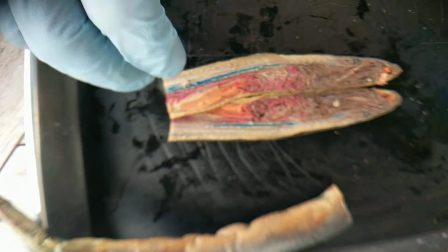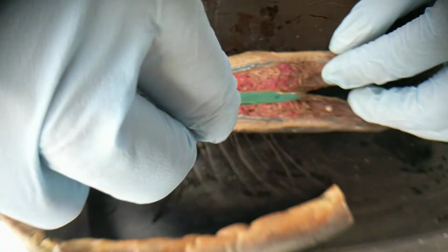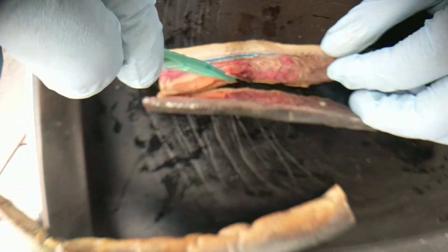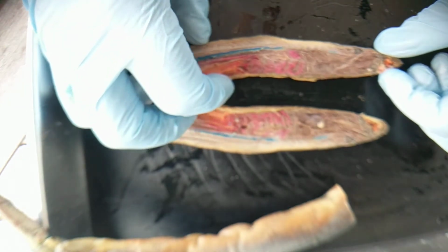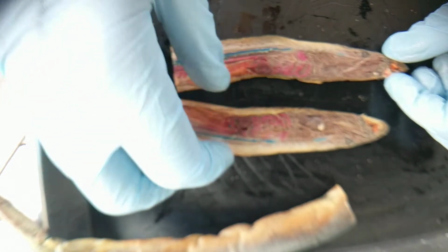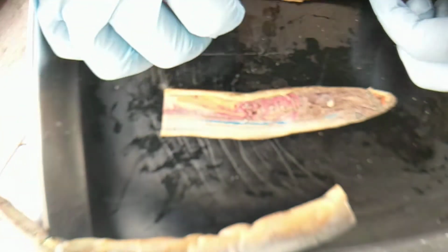All right, so there we are. That's the sagittal section. It's opened up, and I'll just separate the halves here. All right, so we have, oh, it looks pretty good. Okay, so I'll just look at this half first here.